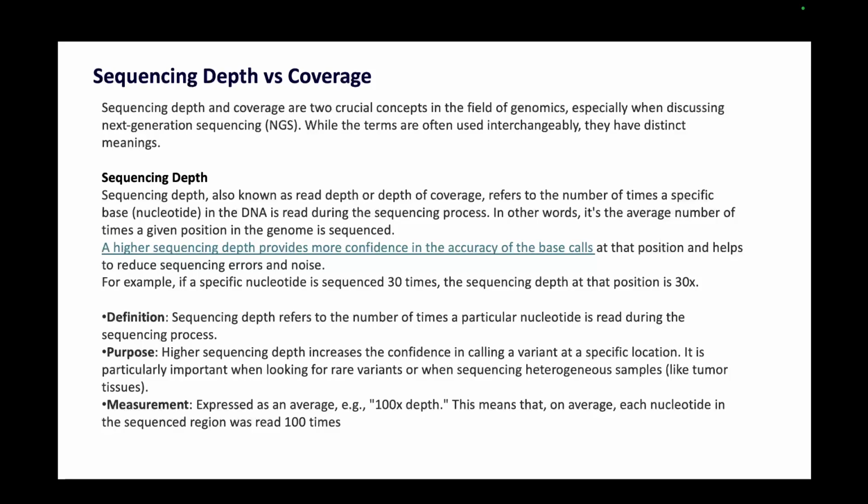So most often, that is how it is done, you'll find that two reads are overlapping by a large stretch of the DNA. If it's more than two reads, like 5, 10, 20, 30 reads overlapping at a particular position of the genome on a particular base, that number is what gives you the sequencing depth or the depth of coverage.